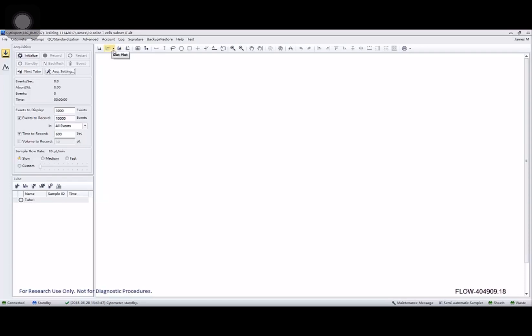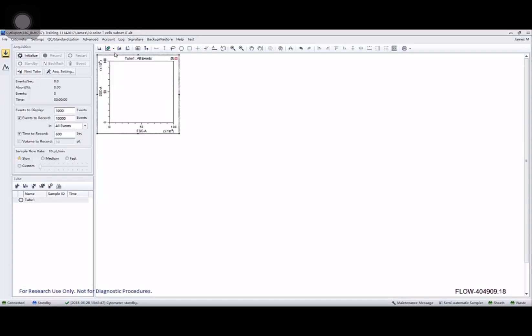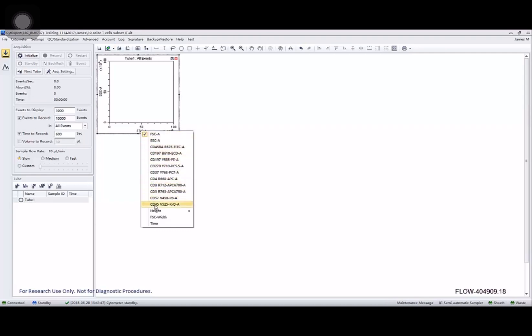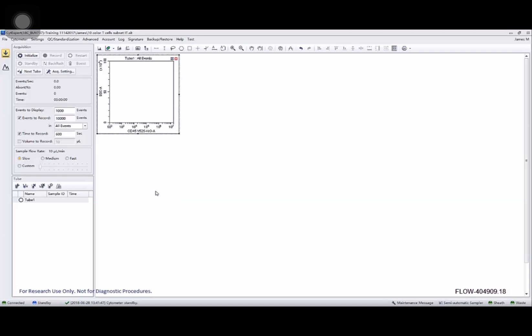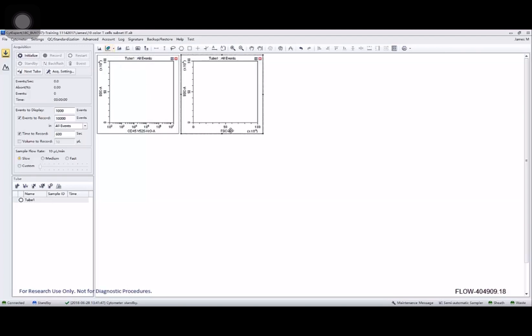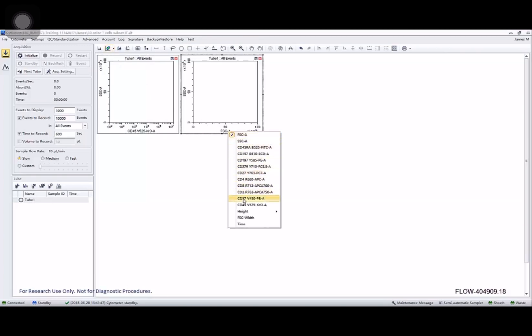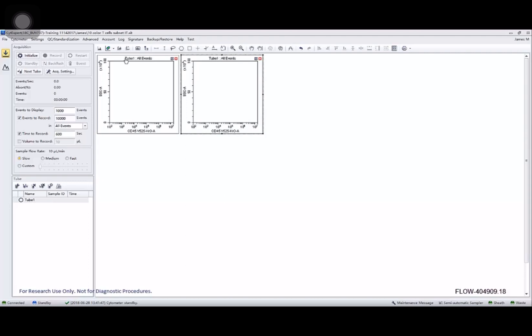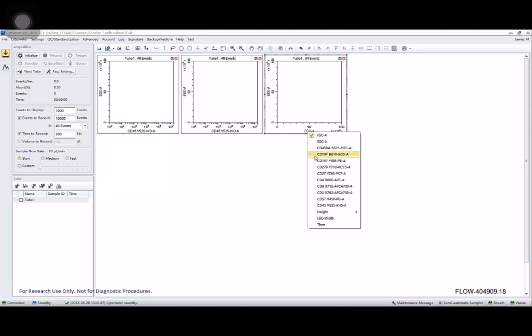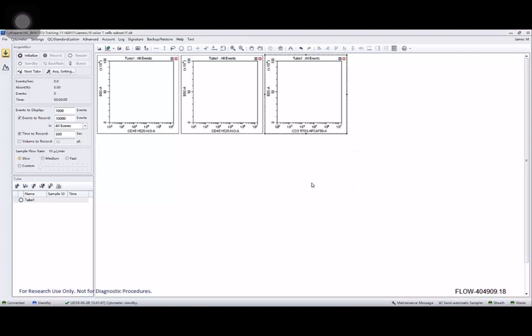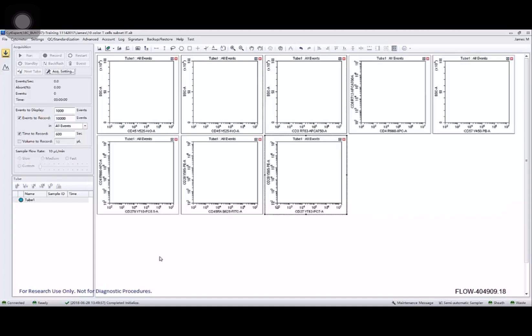Once I'm done I'm going to start creating some plots. Right clicking on the axis title will give you the ability to change that and display what you want. I'm building plots here based on the product insert for our 10 color T cell subset tube, but of course you can do anything you'd like. Okay, there are all my plots.